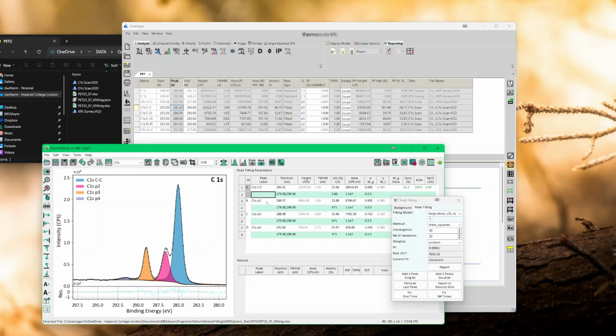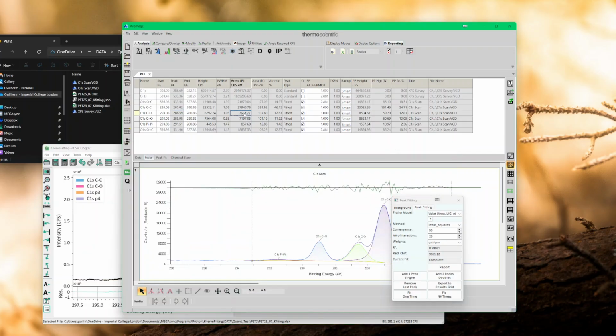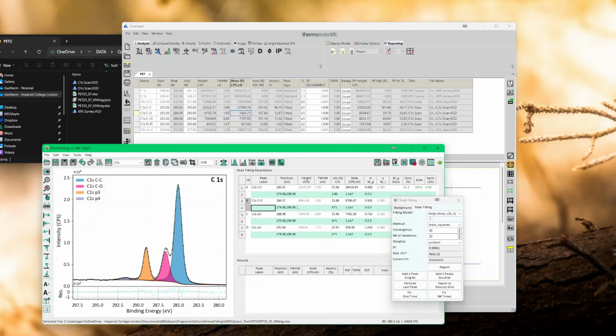And then if we look at CO, so I call that CO, we come to an area of 8,786, and the CO in here has been calculated as, okay, slightly more. Yes, okay, that was the one, sorry. This is 7,664, which is still very close.